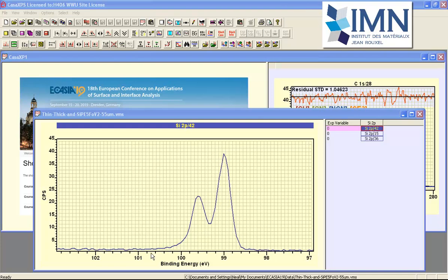We also have a semiconductor, so we have a step in the background. It is also clear from the silicon 2p 1/2 peak that there is some form of asymmetry that is evident in this particular peak, and we anticipate that the 3/2 peak will have a similar sort of asymmetry. So what we would like to do is construct a pair of peaks that will return the correct ratio and fit the data in the sense of a figure of merit, such as a chi-square or an RMS.